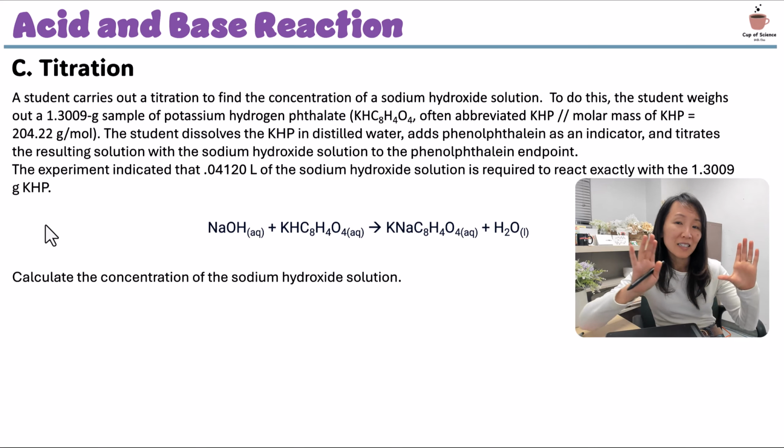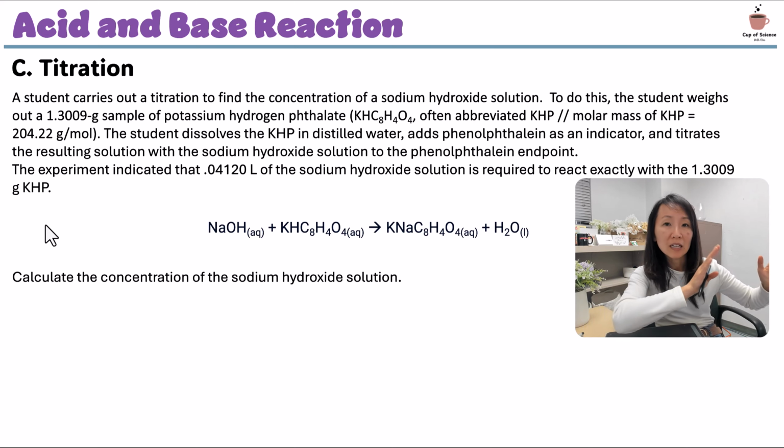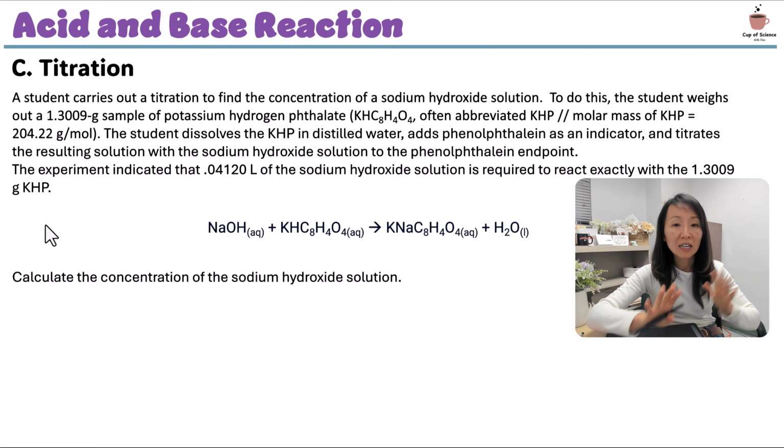This is a problem that is based off of titration. Now, there are a lot of words in here, so I'm going to go ahead and split the view so that you can see this problem and also the experiment of titration side to side.